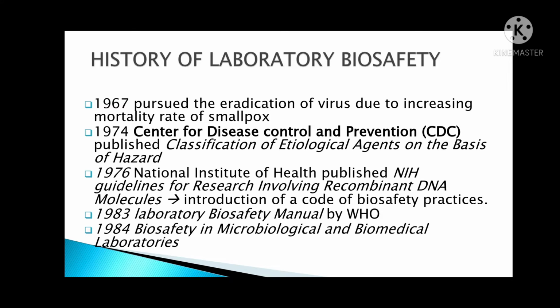This code, along with the World Health Organization's first edition of the Laboratory Biosafety Manual that was produced in 1983, and the Centers for Disease Control and Prevention and National Institutes of Health jointly published first edition of the Biosafety in Microbiological and Biomedical Laboratories.